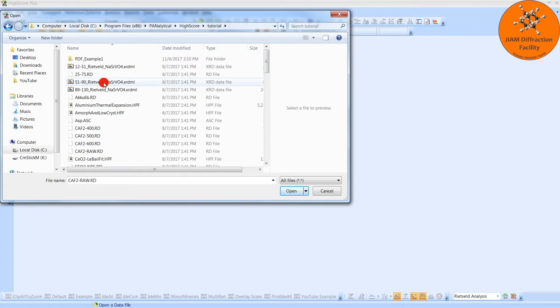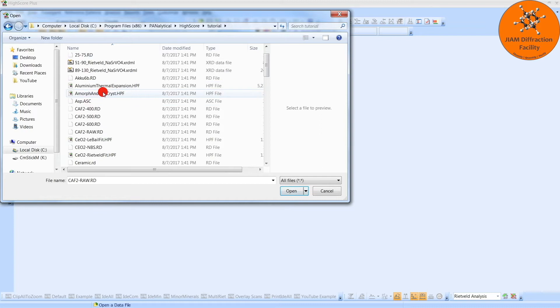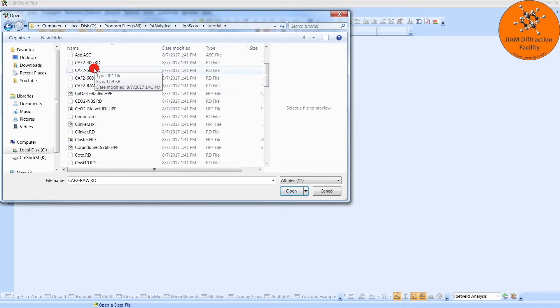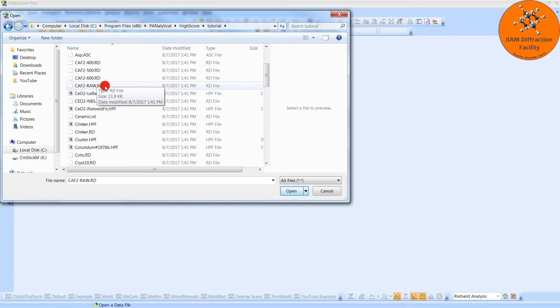And here you see a list of files that are used in the example problems presented in HighScore's help files. I highly recommend that you go through the help file as it is excellent. Now this video will cover how to analyze these files using the Rietveld method, but I will only look at the raw file.